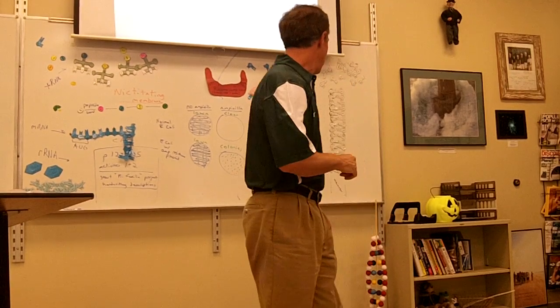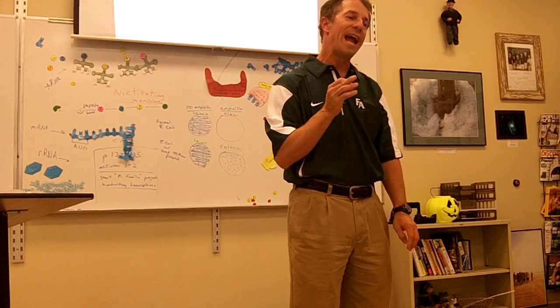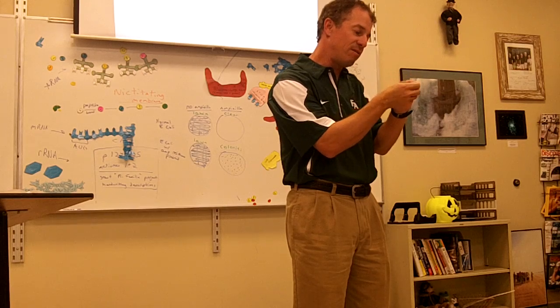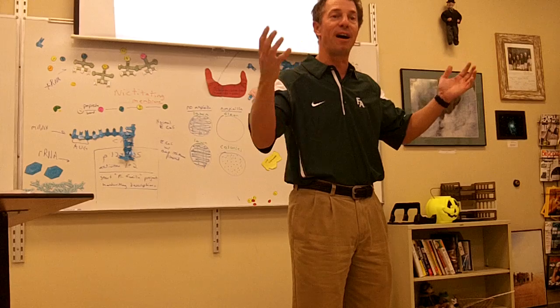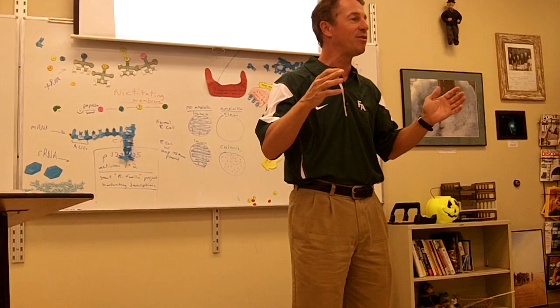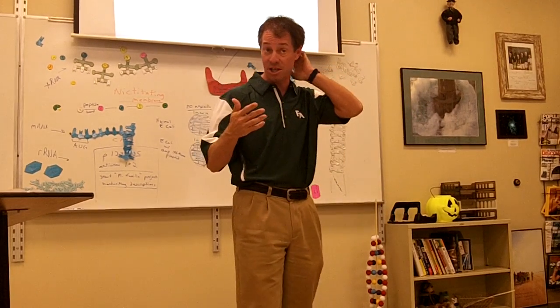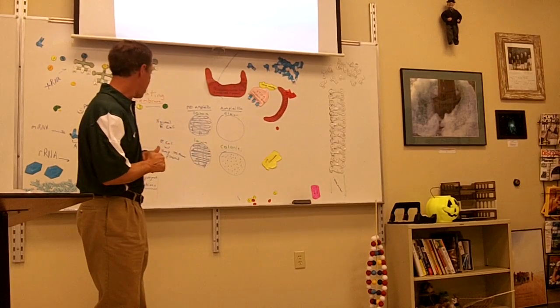Now, to solve a crime like this, what they have to do is take the DNA from under the victim's fingernail, and they have to amplify it so they have enough to work with. And then they have to run what's called a DNA fingerprint. So I want to show you both those processes, and then we'll talk about it a little bit.